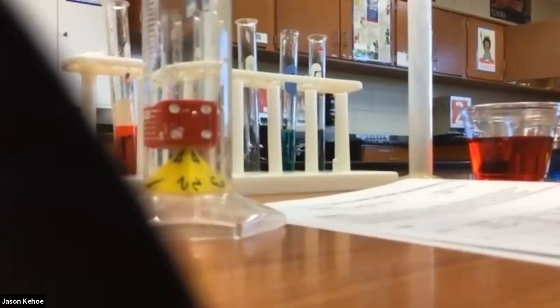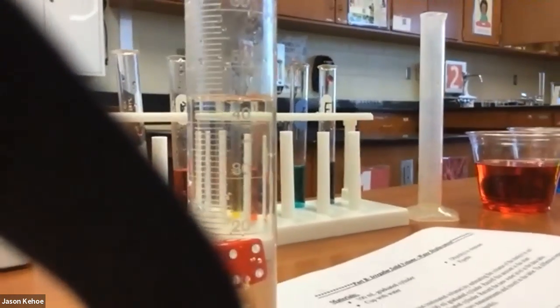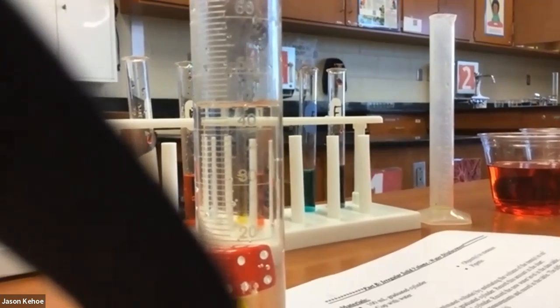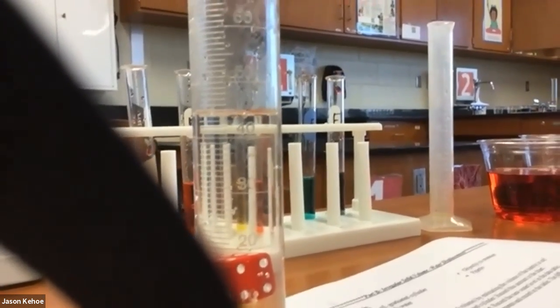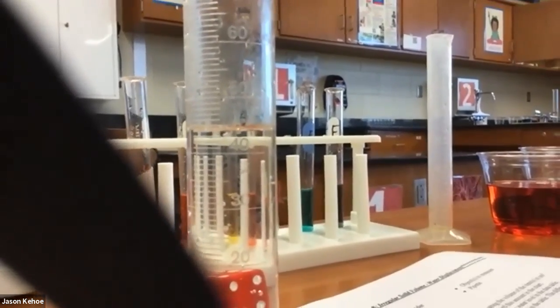We add our items. It was 40 before. I will leave it to you. Wait, I gotta give you a good camera angle at least. I will leave it to you to say what it is now. Just make your best measurement you can there. I know it's a little weird because it's clear, but you'll make your best measurement you can. So you'll write down the volume after adding the items. Then you'll subtract the larger volume from the smaller to find how much the water level went up in milliliters. That is the difference in the water level before and after.